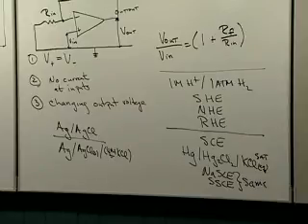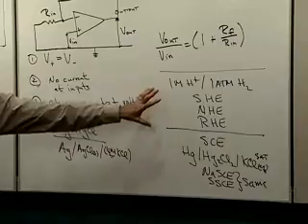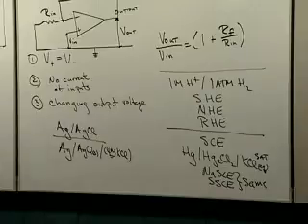On the other hand, if you have the possibility of anything precipitating into your frit, that one clogs up really quickly. So that's a trade-off. Sometimes you like a free flow because you're not concerned about that. And so there are junctions that are just a fiber. It used to be asbestos. I'm not sure what they're using now, but just fiberglass probably. Just a fiber that goes through. And now you have much faster transport of salts and liquids between the two compartments.